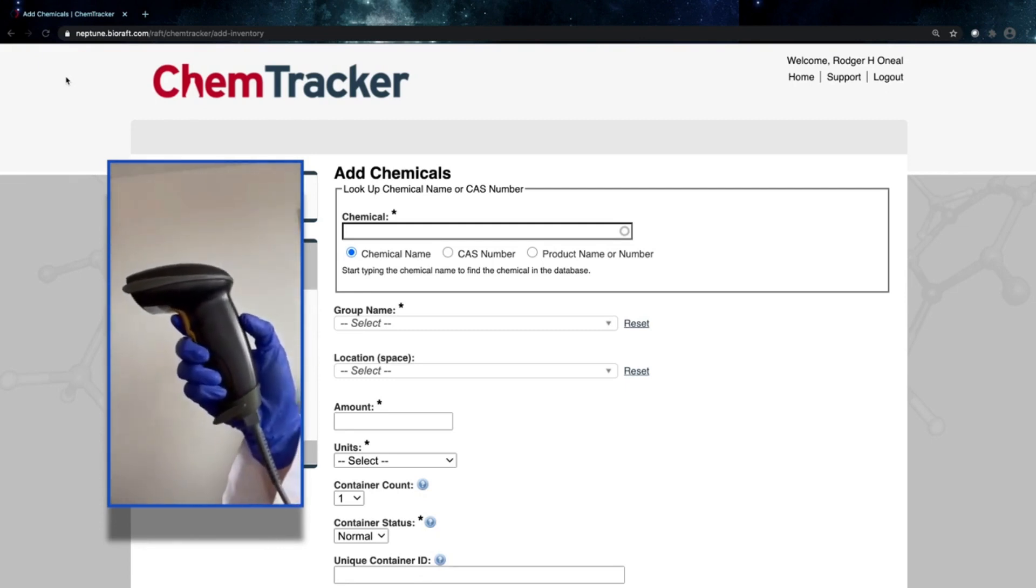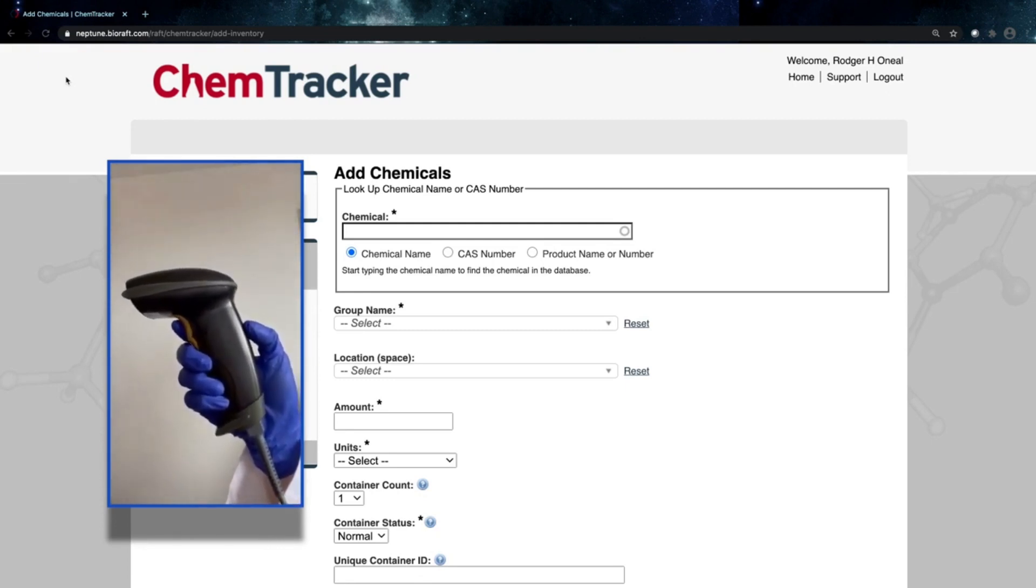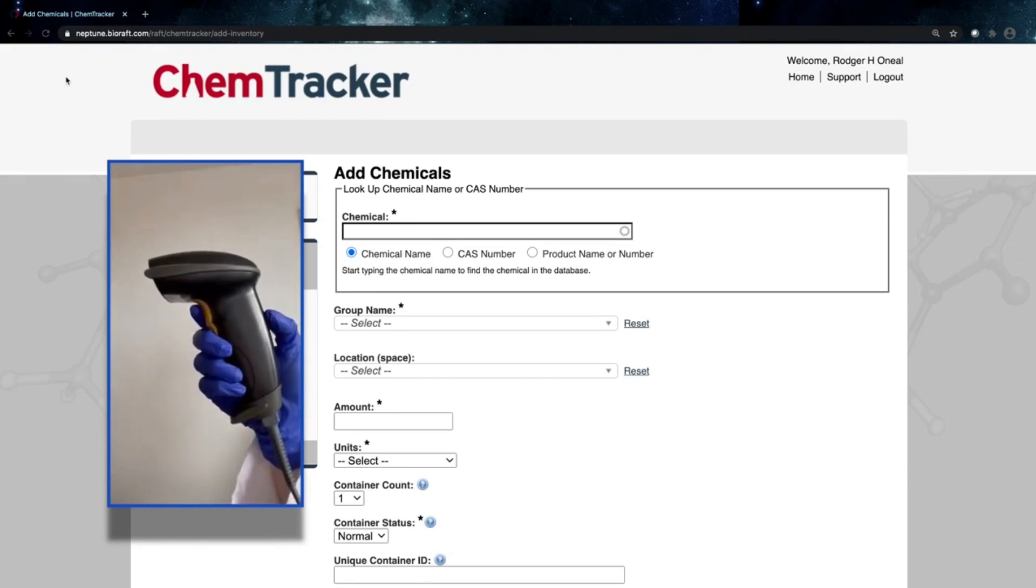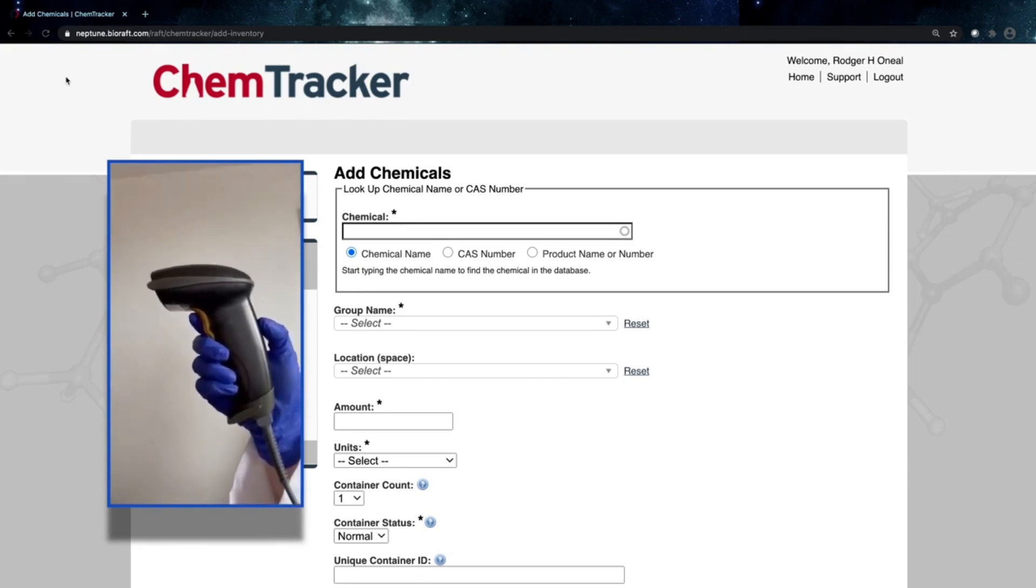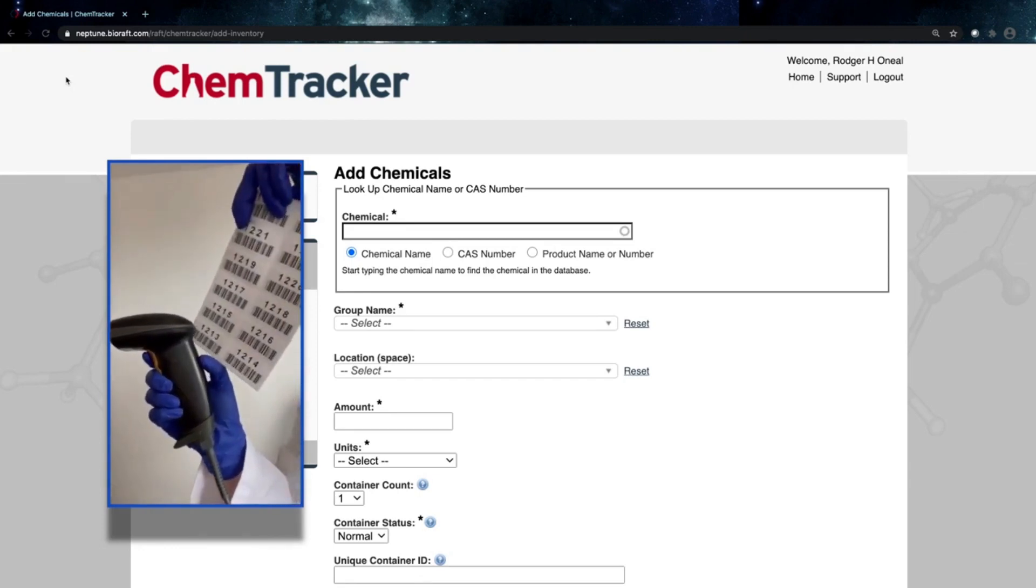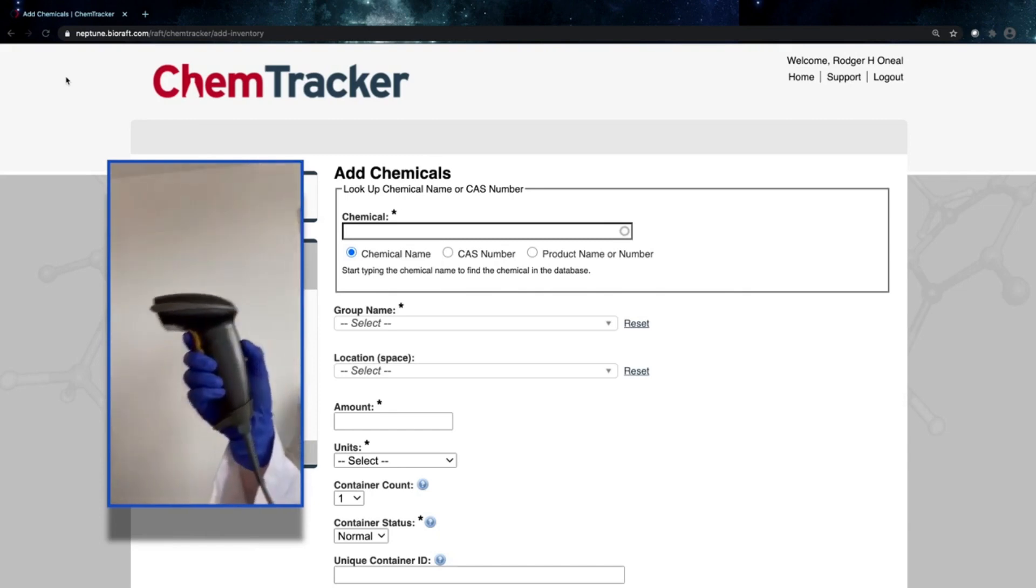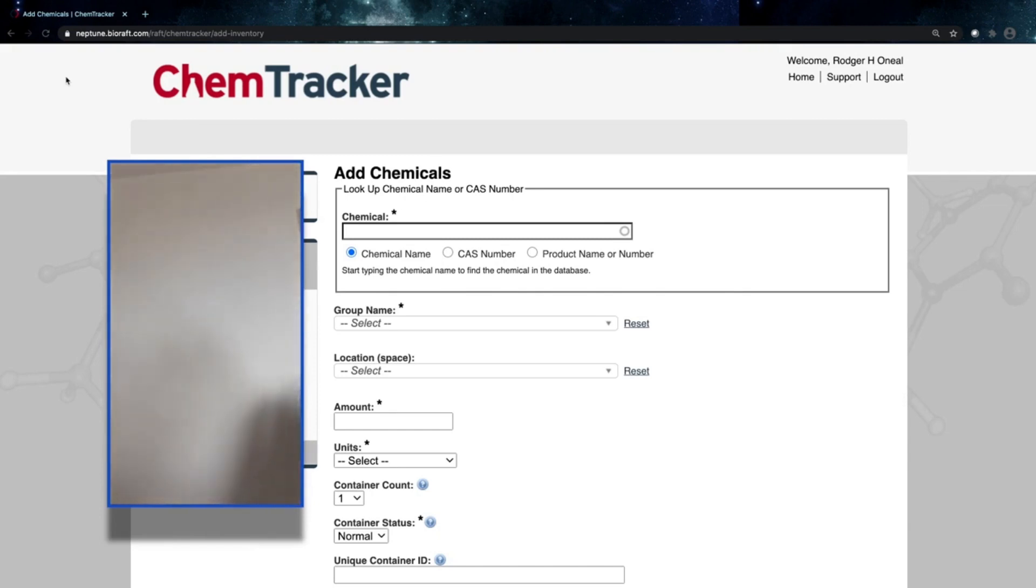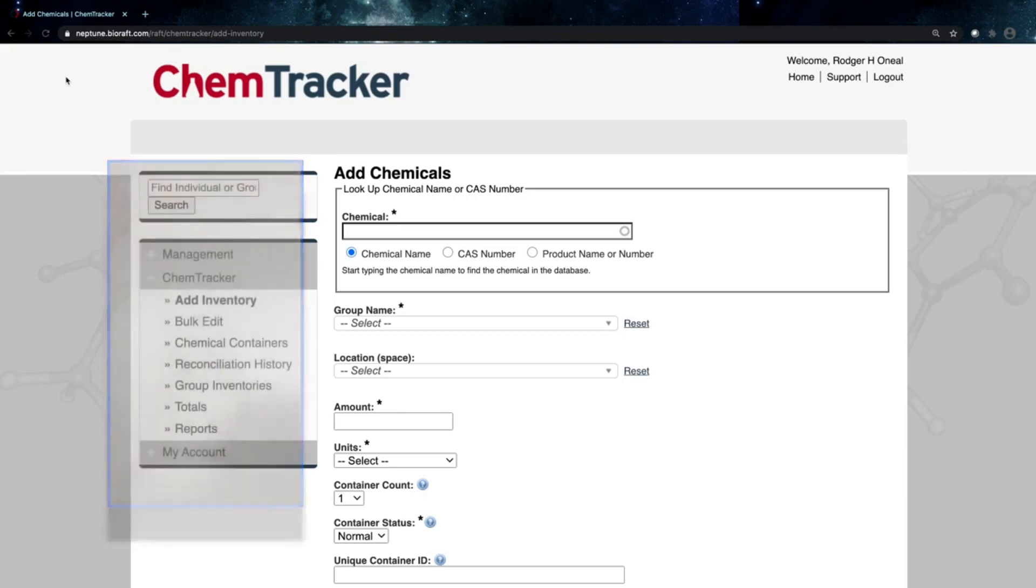Now I have a wired scanner that I'm going to be using, but you can also use a Bluetooth or other type of wireless scanner with ChemTracker. There's no specific requirements on the type of labels or scanner that you need today. Anything that has a standard form with numbers, even letters, will be utilizable with the system.